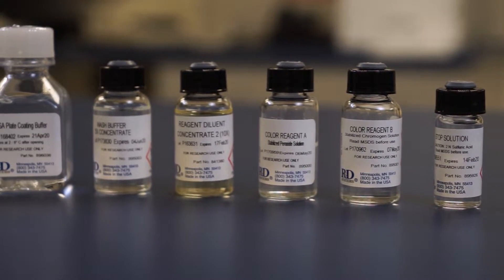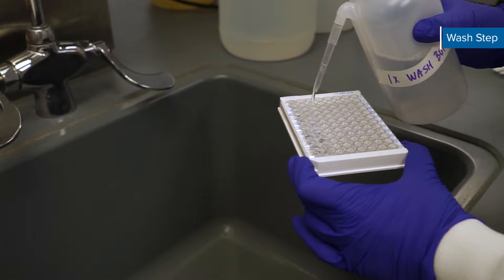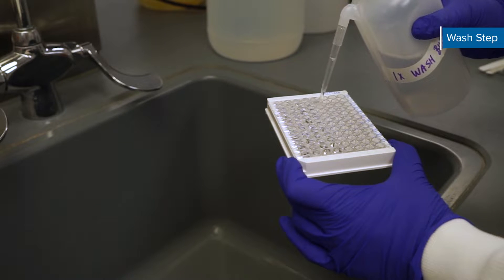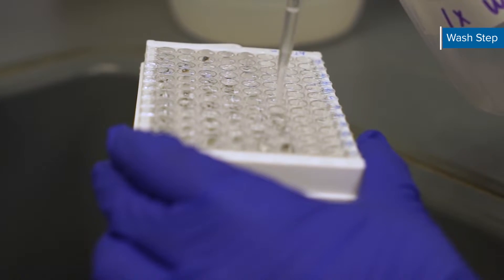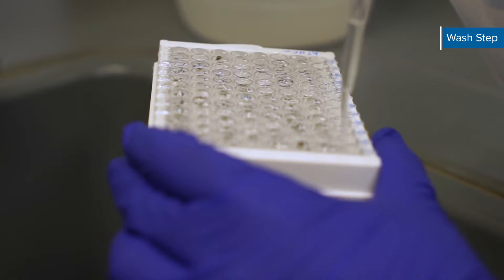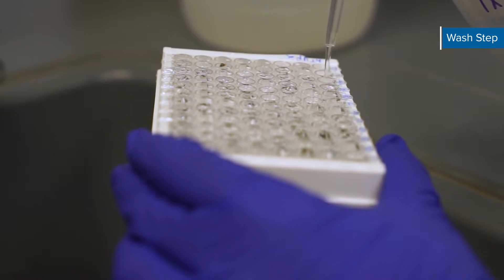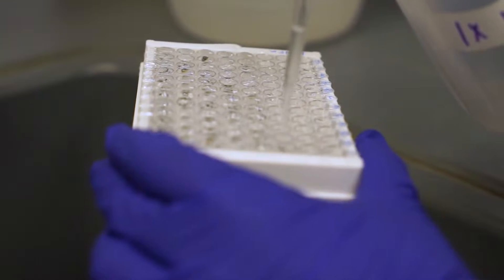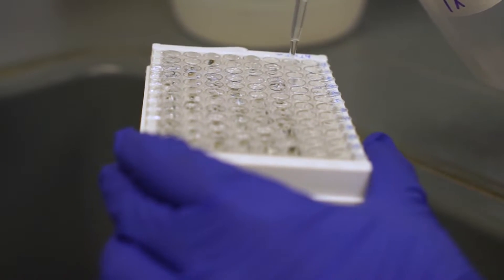On day two ensure that all reagents are equilibrated to room temperature. Aspirate or decant each well from the coated plate and wash by filling each well fully with wash buffer using a squirt bottle, manifold dispenser, or auto washer. Washing with a multi-channel pipette is too gentle and lacks the force to thoroughly flush the wells. Thoroughly decant by blotting the inverted plate against clean paper towels. Repeat this process for a total of three washes.